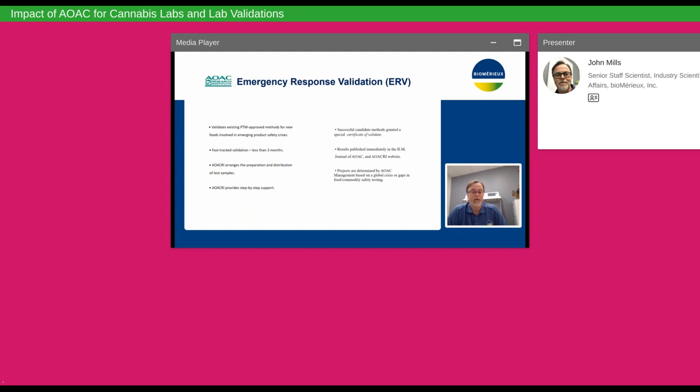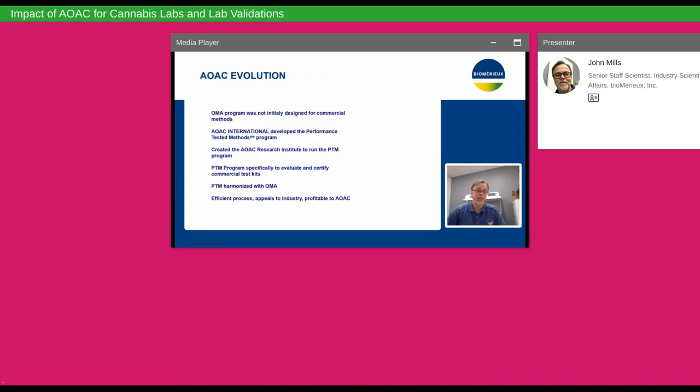These projects are normally determined by AOAC management based on global crisis or gaps in food commodity safety testing. And this program was actually recently employed by AOAC for an ERV in cannabis, and that's yeast and mold enumeration. Let's talk just a little bit about AOAC Evolution and the OMA program and the Research Institute.